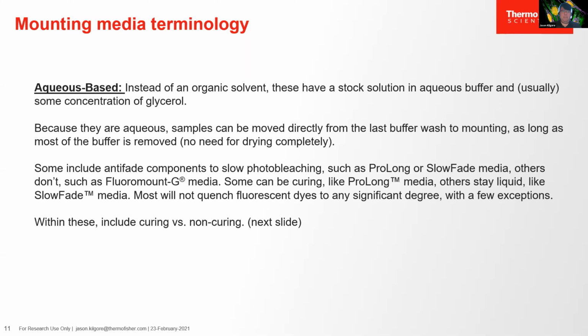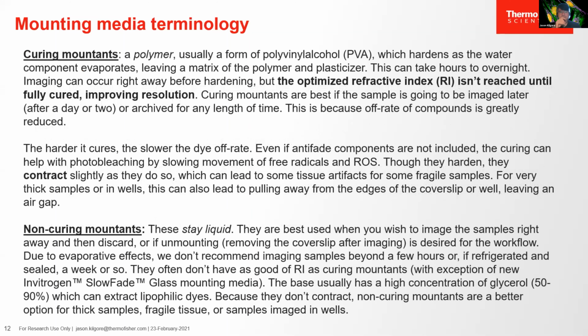So I'm going to discuss some of our fluorescent anti-fade mounting media, not as an ad for our company, but really to discuss some of the aspects of anti-fades and what we've done to develop them over the years to make them better.